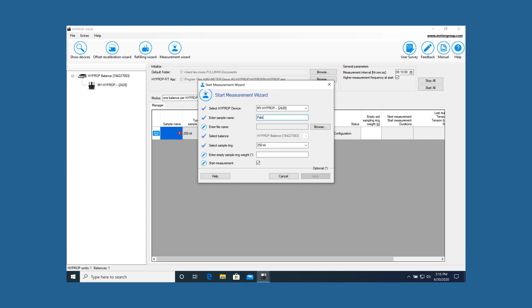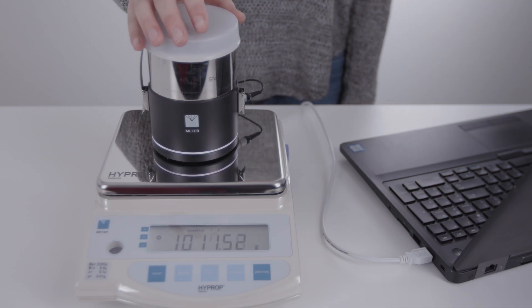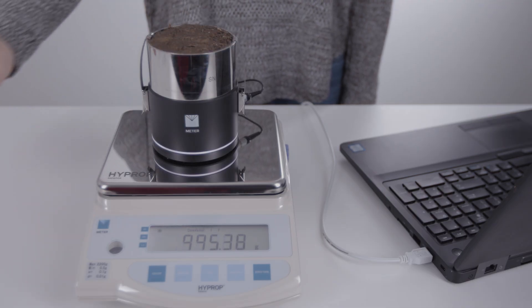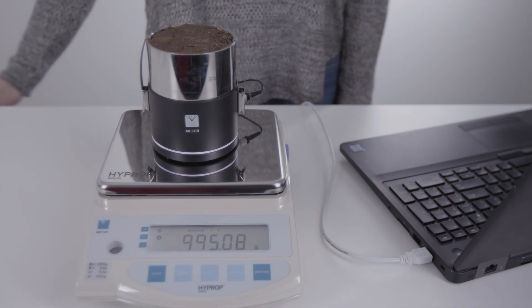Measuring unit, name of the soil sample, sample ring type, sample ring weight. Remove the plastic cap from the sample and click apply.